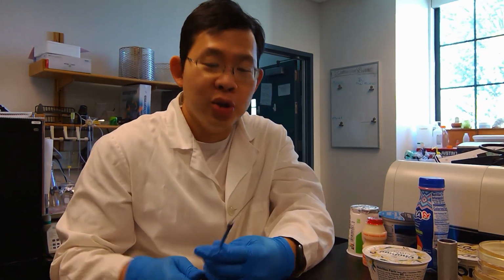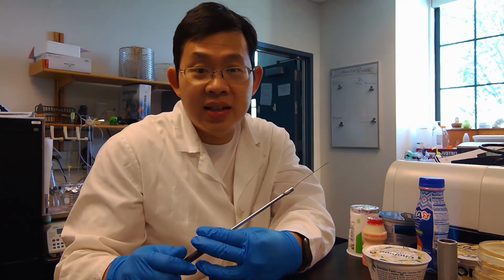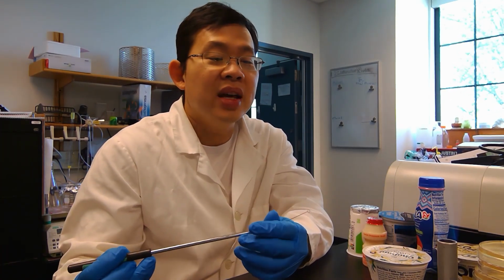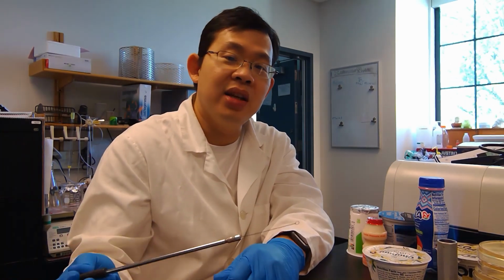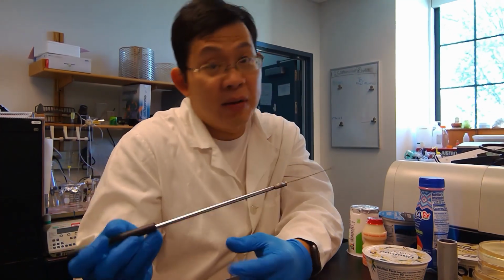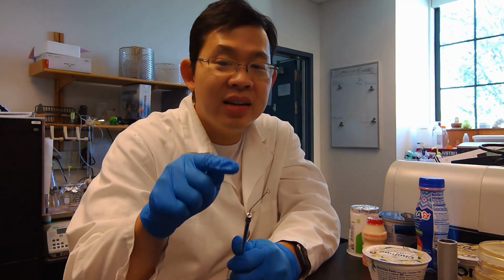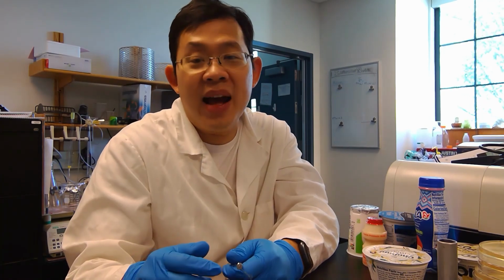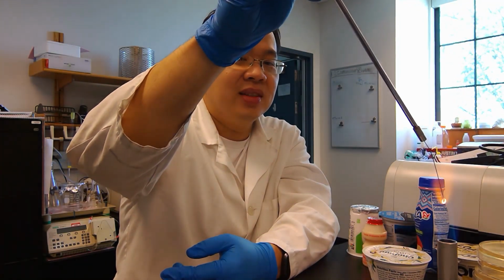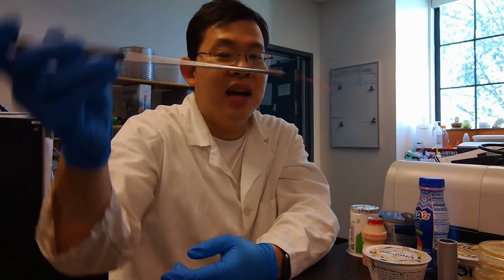So how do you make sure that there is no other bacteria on your loop? Well, you want to sterilize it, and the most common sterilization technique that you do in microbiology lab is the Bunsen burner. So basically, you want to flame your loop until it's red hot. When it's red hot, you know it's sterile. If you have any biological entity there, the moment it turns red, it becomes ashes essentially. Now, let's flame our loop. Now you see it, it's orange. Now this one is sterile.